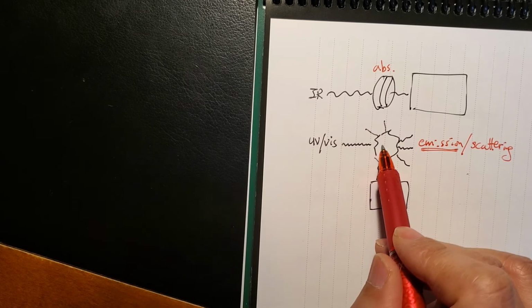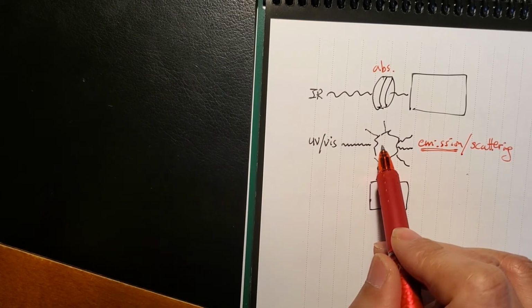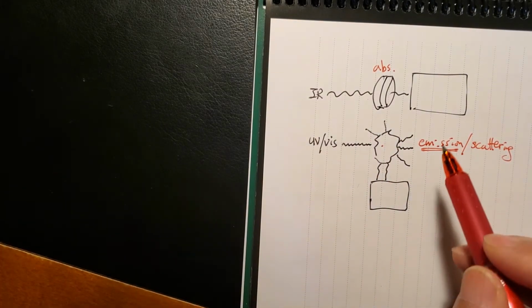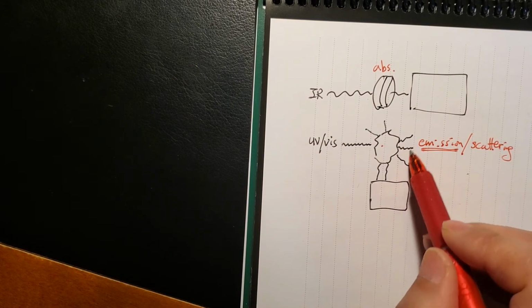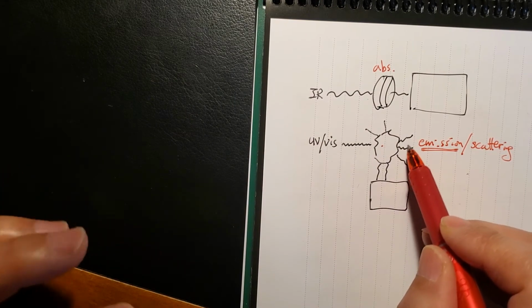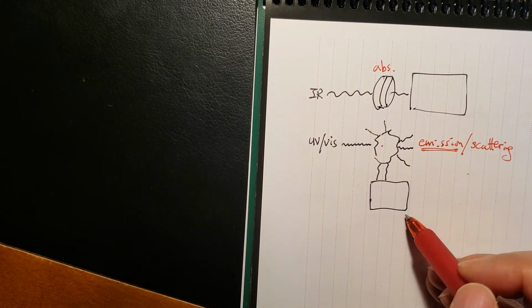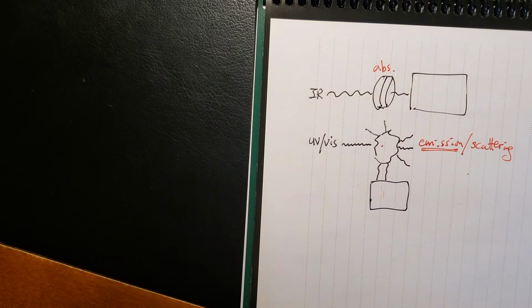The light will be completely changed to a new frequency, a new wave, and it will come out in all directions. So to minimize the interference of the original frequency, because we don't want to measure that, unlike the IR, we place the detector perpendicular to it so we can have maximum orthogonality for minimum interference, because quantum particles do not communicate at a 90-degree angle.